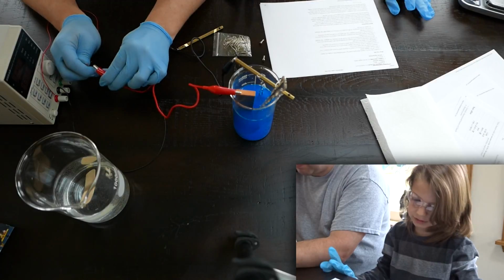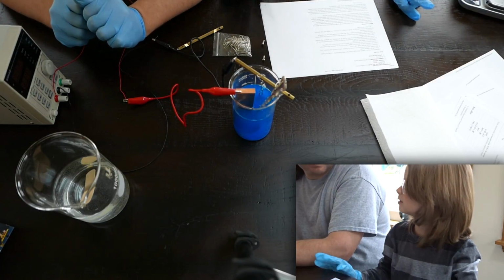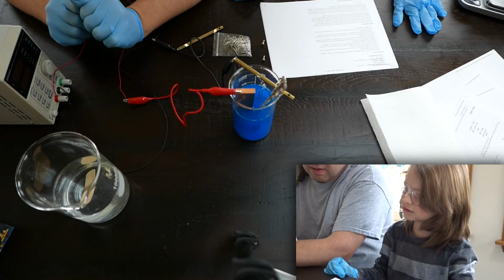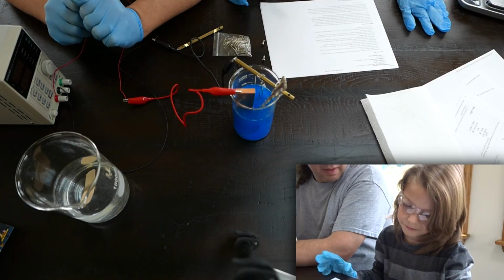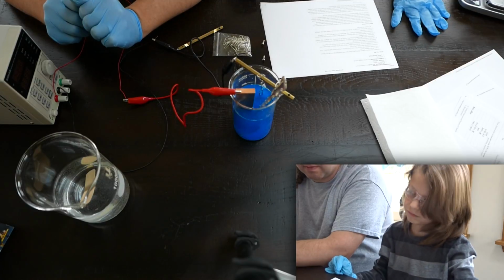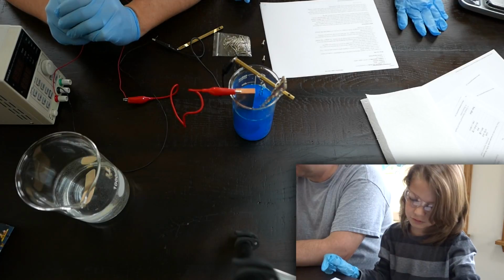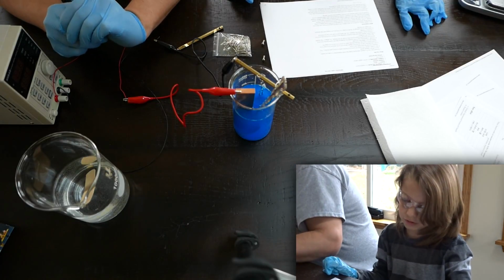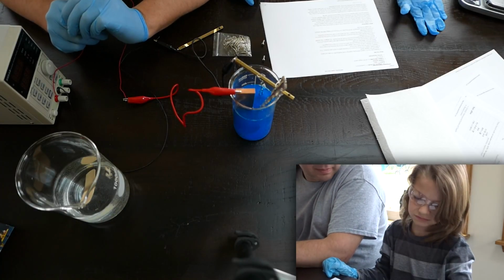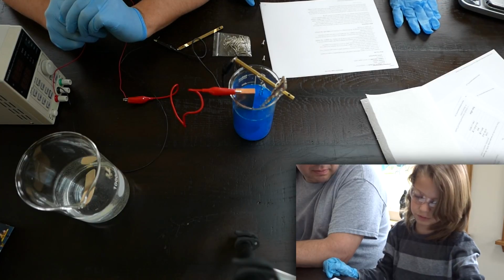Does it say anything else? What we gotta do? At 6, it says wait for 20 to 30 minutes until you are happy with the amount of copper on the stuff. But we're not there yet. We're on 4, partially suspend the key, which means fork or quarters, in the solution while wrapping the wire lead loosely around the pencil. Oh, so they were placing the pencil across the mouth of the beaker.